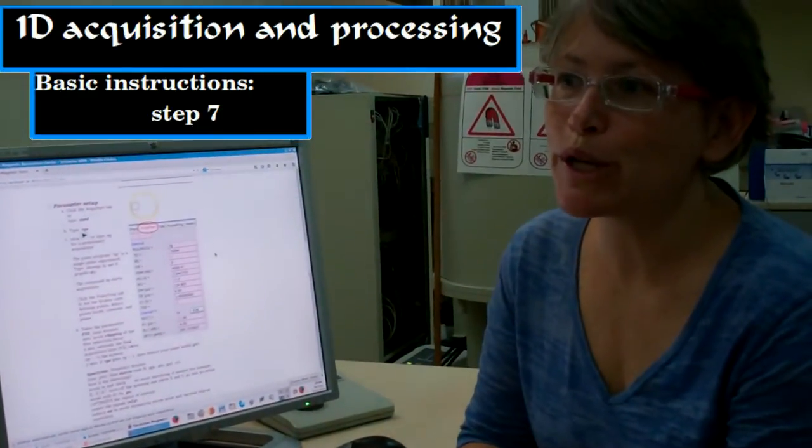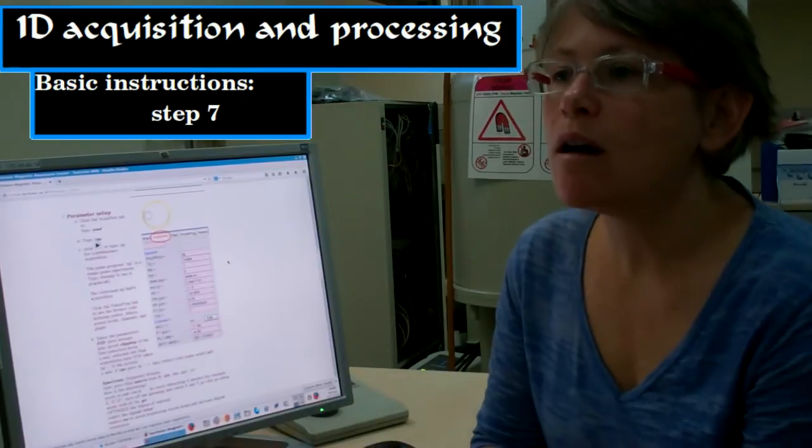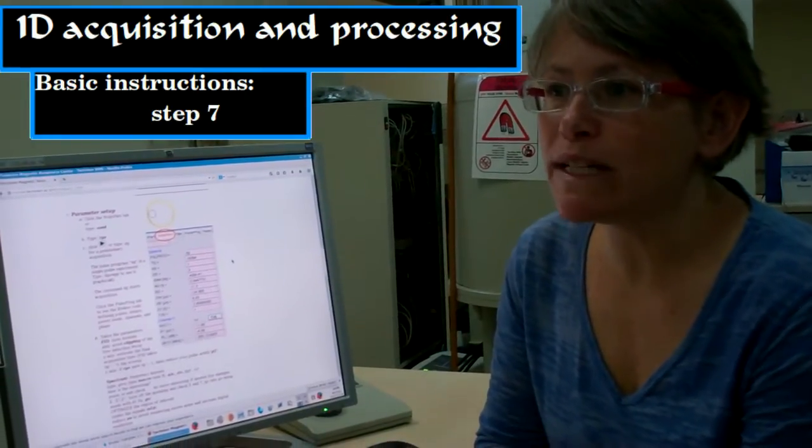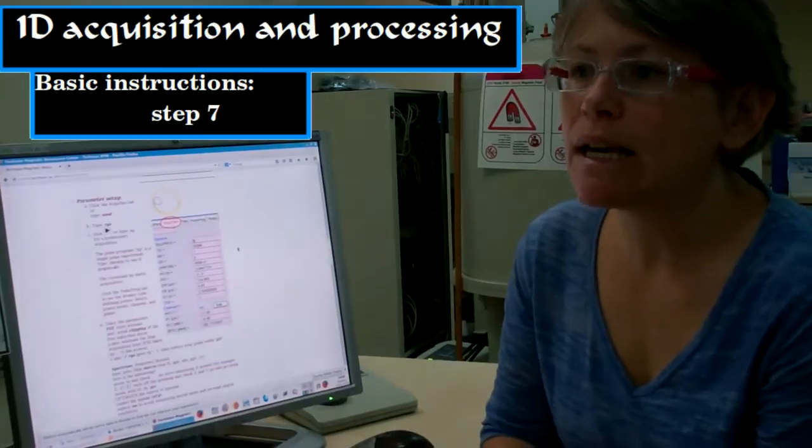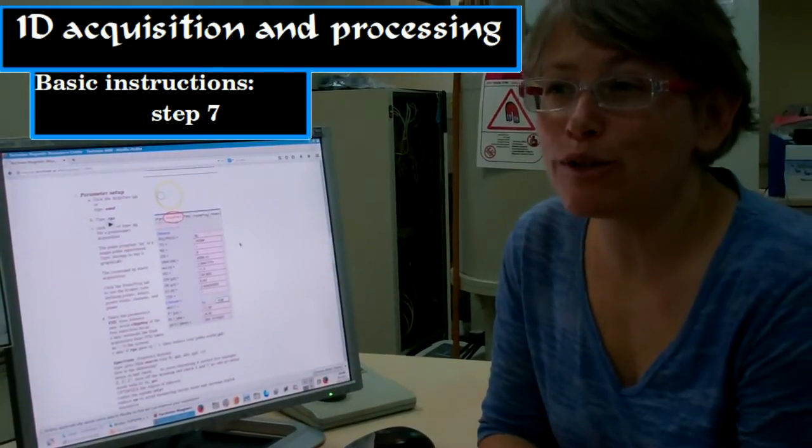We've arrived at the heart of the Proton NMR demonstration lesson. We're on step number 7 of our 1D acquisition and processing instructions list. This step will take us two videos to explain.